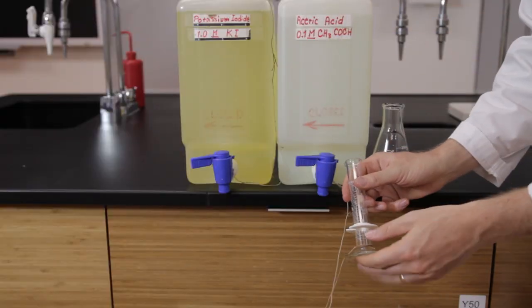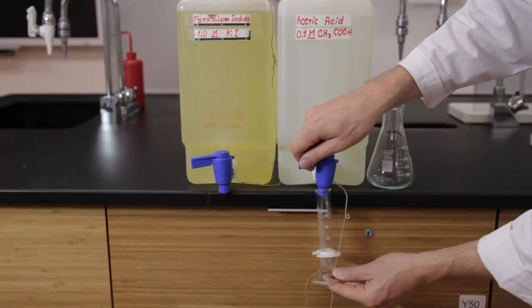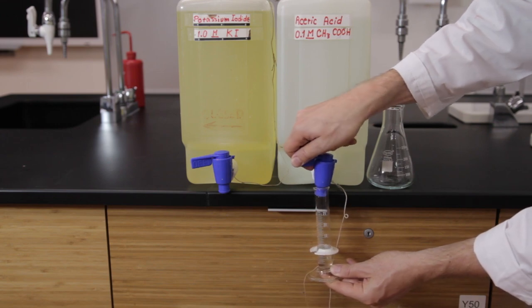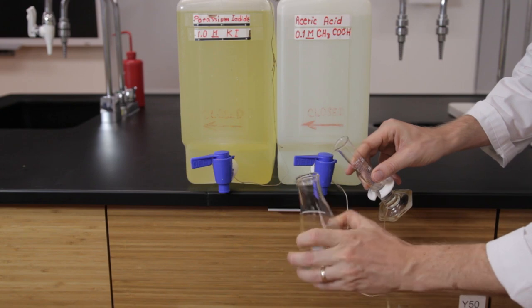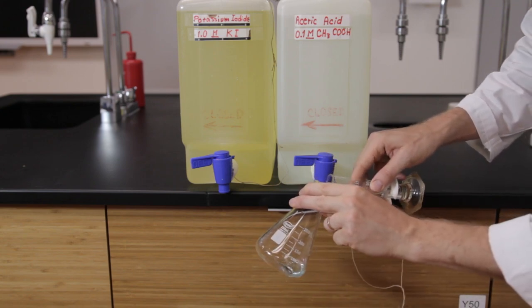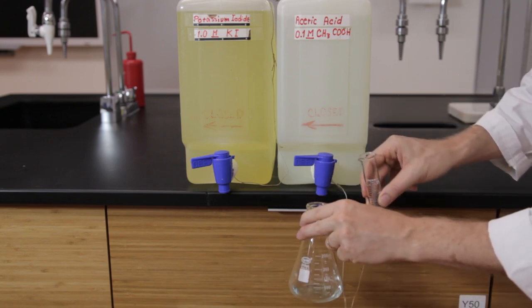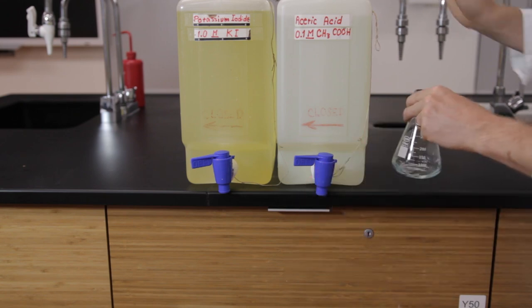To the same Erlenmeyer flask, add about 20 milliliters of potassium iodide solution and about 10 milliliters of the acetic acid solution. The order of addition does not matter. A white precipitate will form and will stay throughout the entire titration.